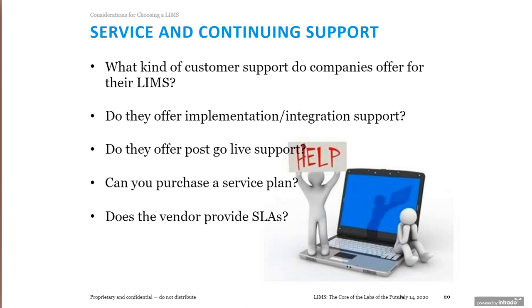So there are many considerations, as you can see, once you decide that it's time to acquire a laboratory information management system, to ensure you select a vendor that, as I say, has your back.